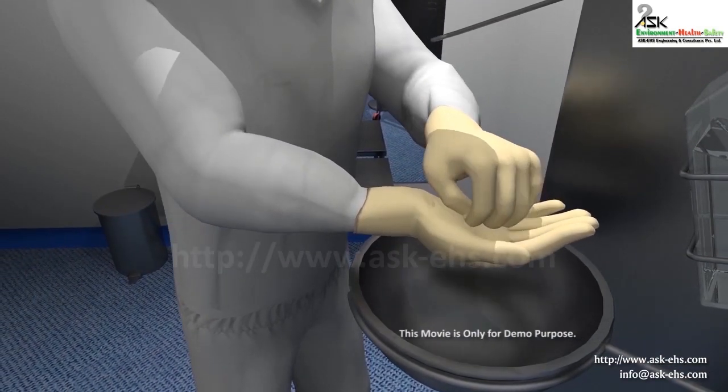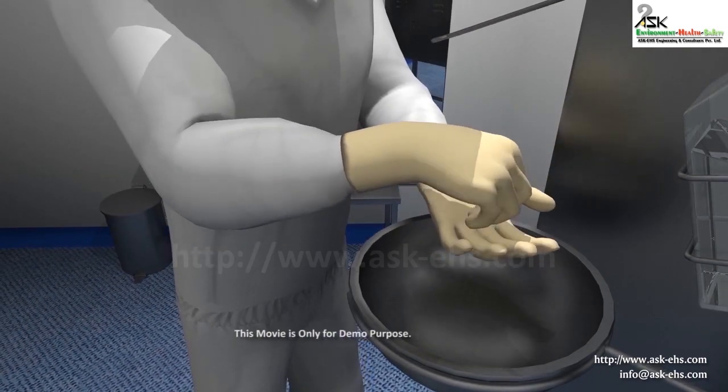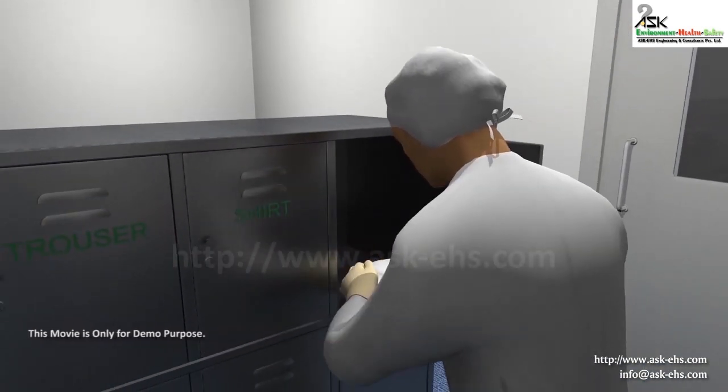Do rotational rubbing with clasped fingers of right hand in left palm and vice versa. After hand sanitization, take a white aseptic cap.